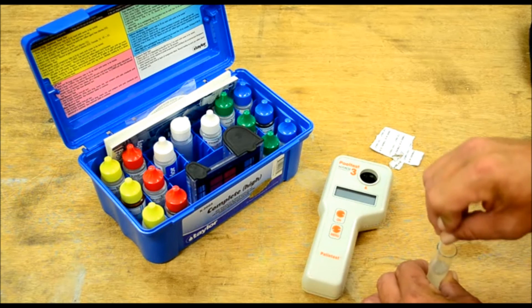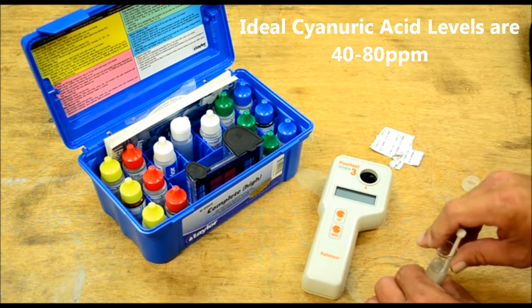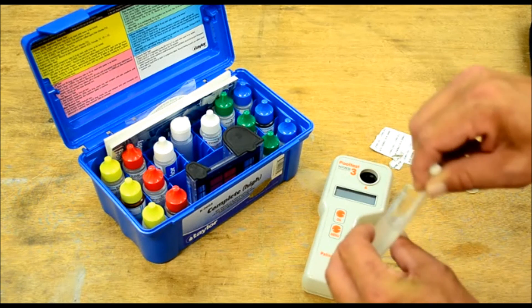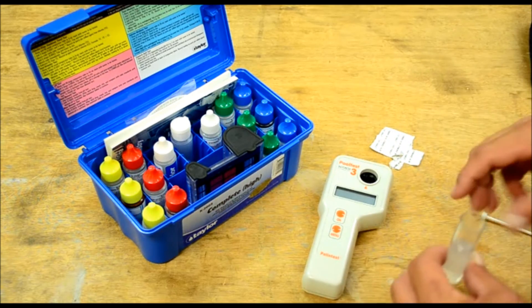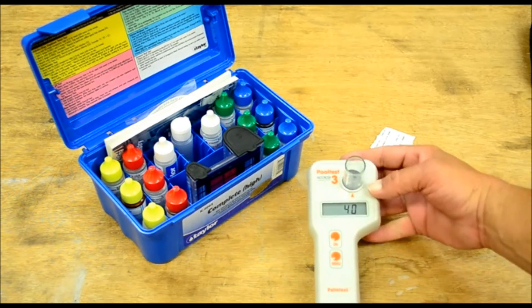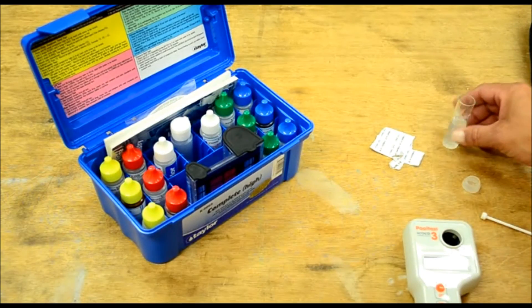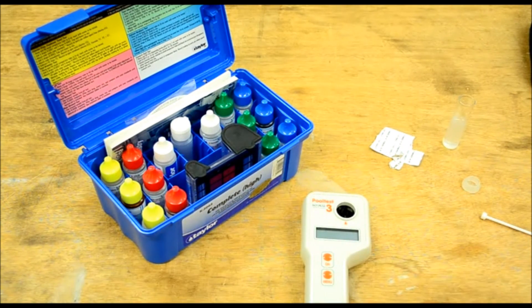We'll mix this until it's all gone and get it all dissolved. Everything is dissolved. This tells us that our cyanuric acid is at 40 parts per million. It was too low to read accurately with the chemical tester. Our ideal situation on cyanuric acid is under 100, so 40 is pretty good.